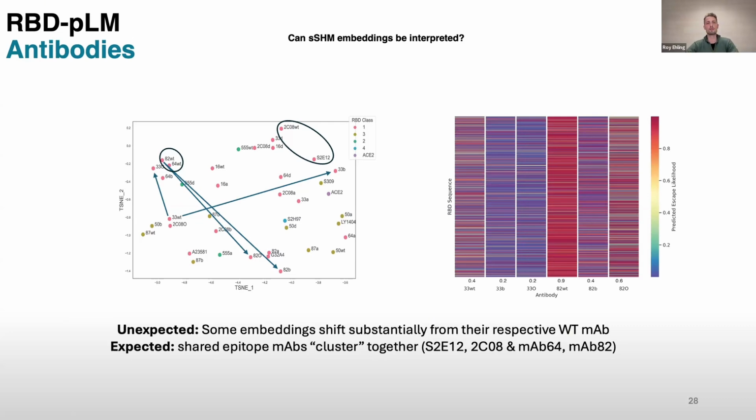When we do a FACS experiment, we can see whether more or less is ending up in the binding or escape fraction, but not which mutations. And using our model, we were able to comprehensively map which mutations are escaped and bound by the clonotype libraries.